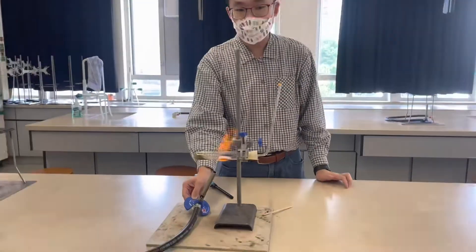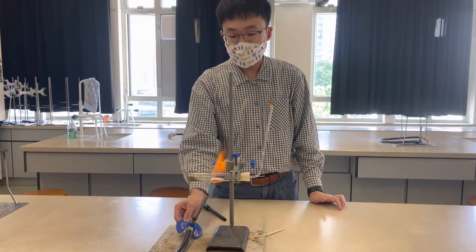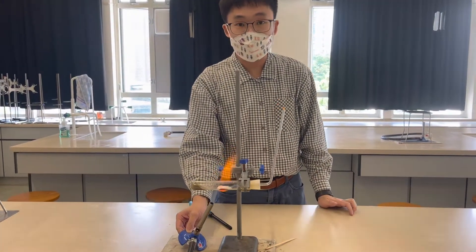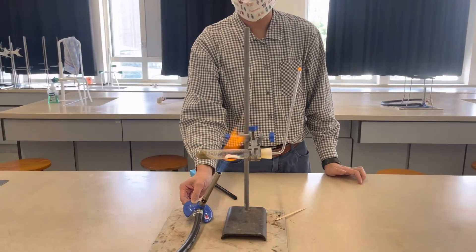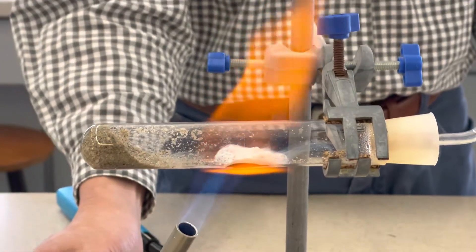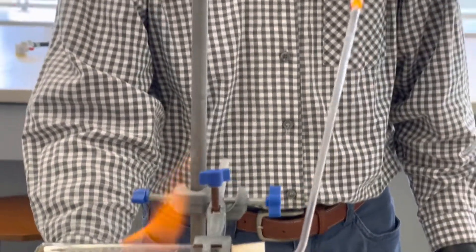And after glowing, the magnesium has turned into a very characteristic white color, which is the formation of magnesium oxide.